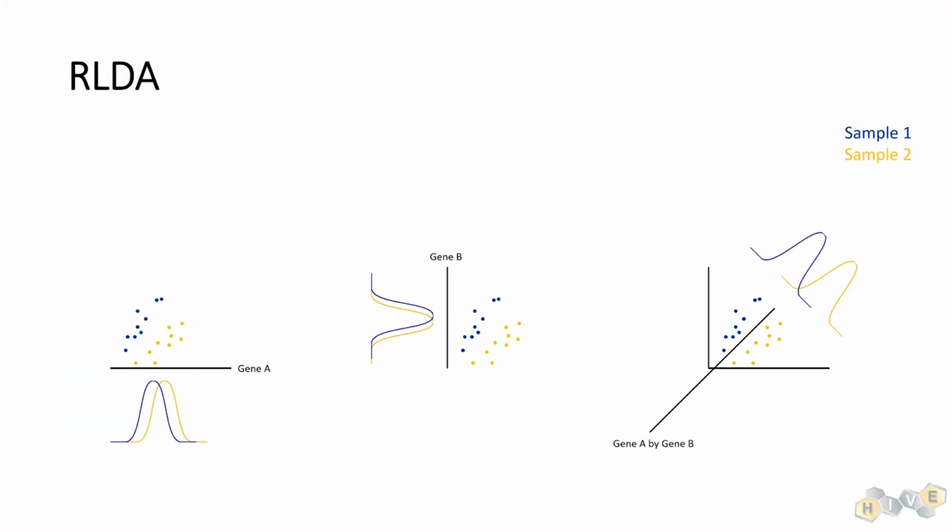They're both doing dimensionality reduction to try and show you what your data looks like from some other perspective, but they're looking at two different goals. And so that makes LDA a perfect fit for something like RNA-Seq, for example. But I should also mention that it doesn't only have to be used for that. You could theoretically use it for something like SNP detection or something else. But the way that this pipeline is built is specifically designed for RNA-Seq, and so that's what I'll show you.